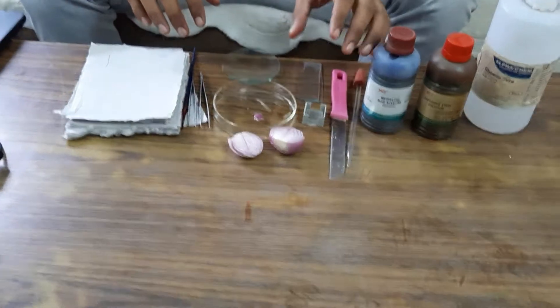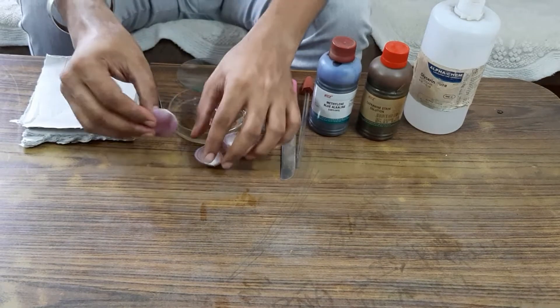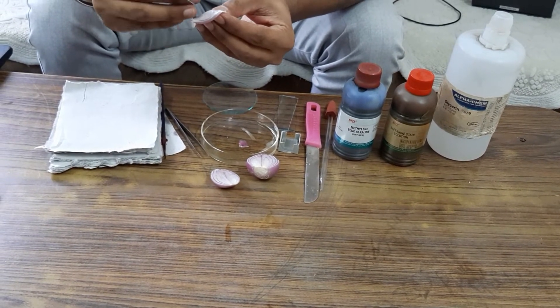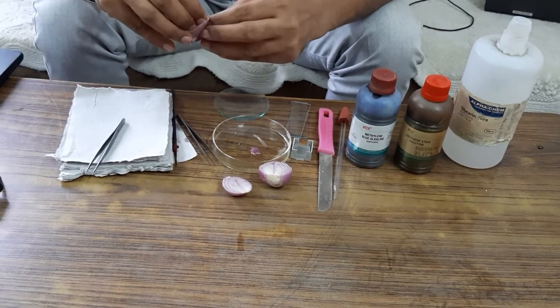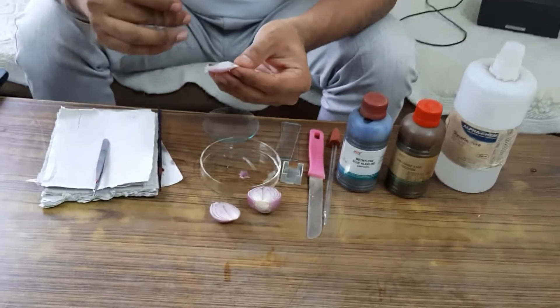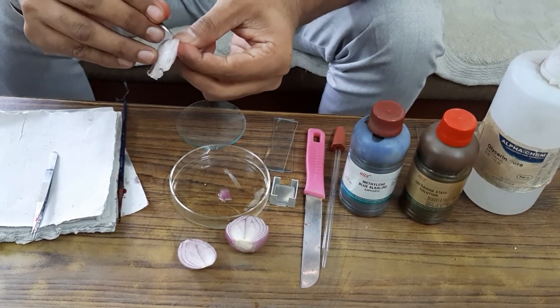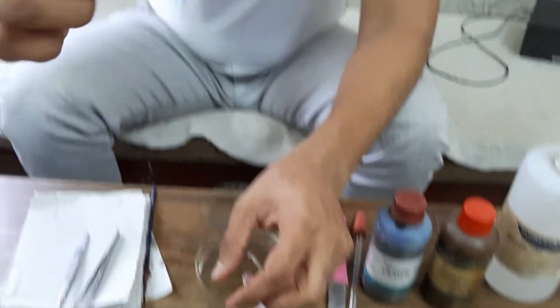Now let's prepare the temporary mount of onion peel. From the inner side of this onion I have taken a piece, and using the forceps I will remove the onion peel. You can use forceps or by hand you can take a thin onion peel. So here I have taken this onion peel.